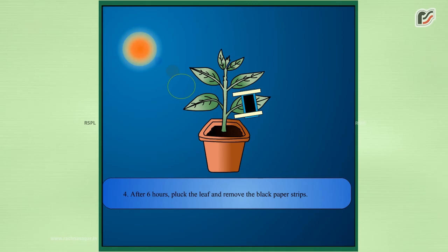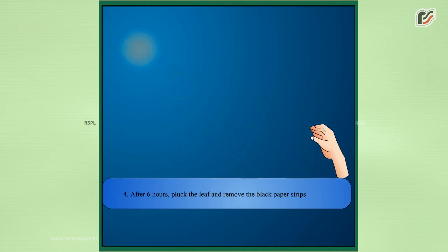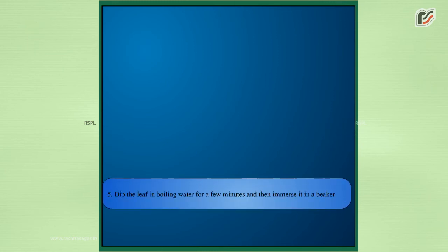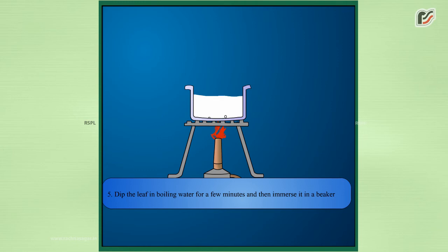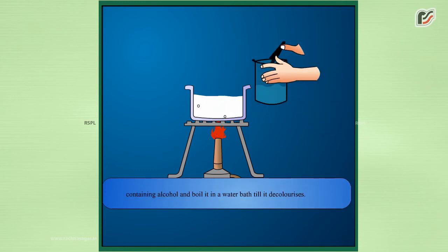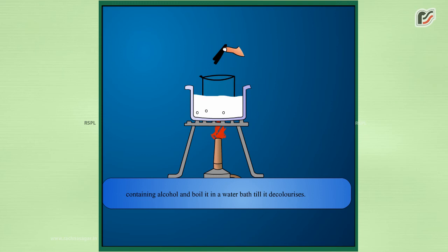After six hours, pluck the leaf and remove the black paper strips. Dip the leaf in boiling water for a few minutes and then immerse it in a beaker containing alcohol and boil it in a water bath till it decolorizes.